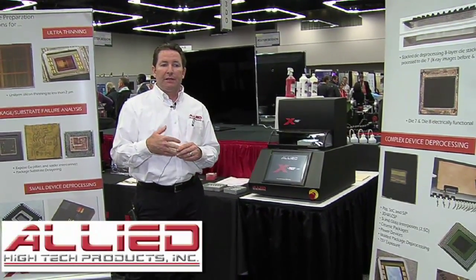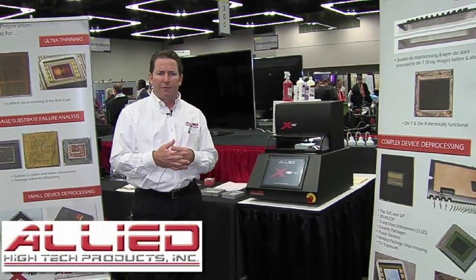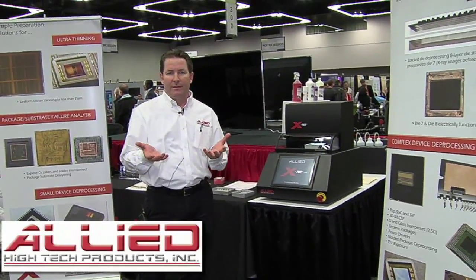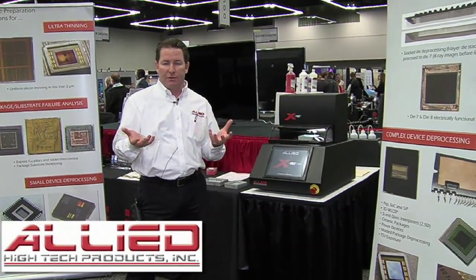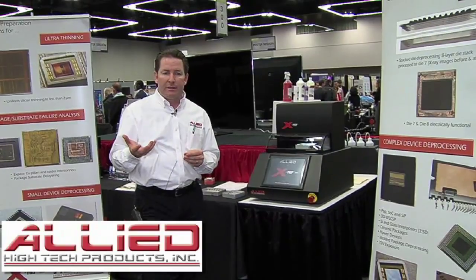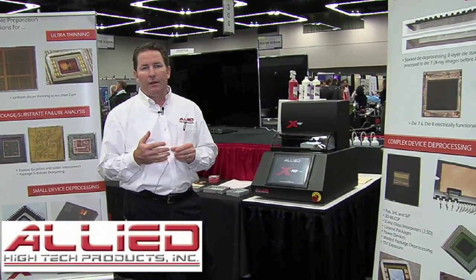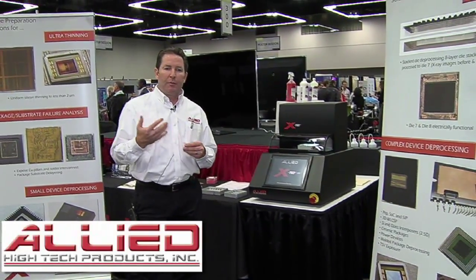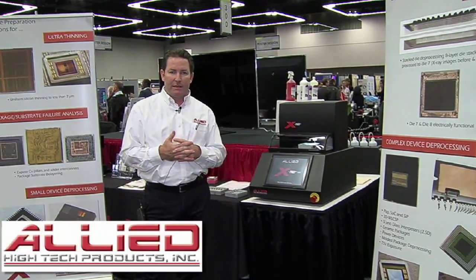This is particularly useful and applicable for visible light probing and also for package deprocessing for back side or front side SoC device deprocessing, stacked memory, and 2.5D architectures. The spindle has a half horsepower motor that runs from 5,000 to 100,000 RPM, giving it both the power and the range to allow a wide variety of materials to be deprocessed.